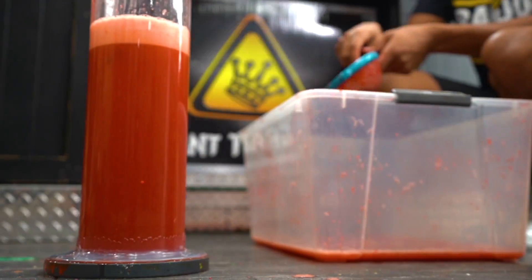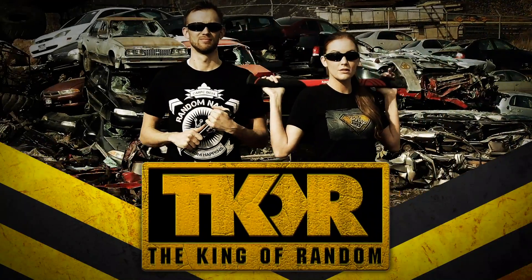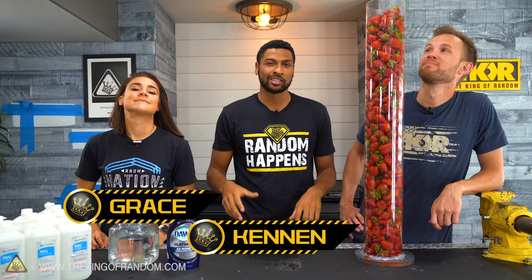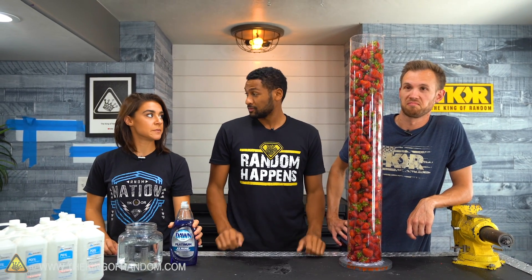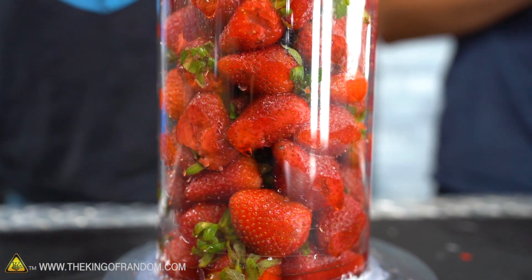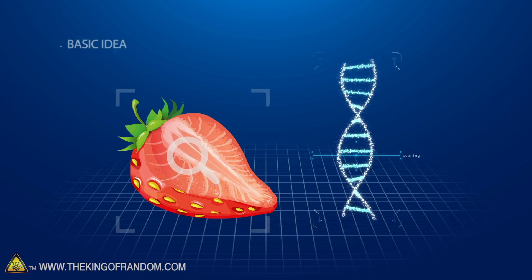In today's video, we will be extracting DNA from 24 pounds of strawberries. Maybe you guys have seen this in your biology classes or going around online. A common experiment done in biology classes is to extract the DNA out of different things. You can take it from your cheek or from plants, such as strawberries, bananas, and even kiwis. Everything has DNA — it's the cool stuff that makes you into what you are and makes everything that's living into what it is. So we're going to figure out what you can do with 24 pounds worth of DNA.